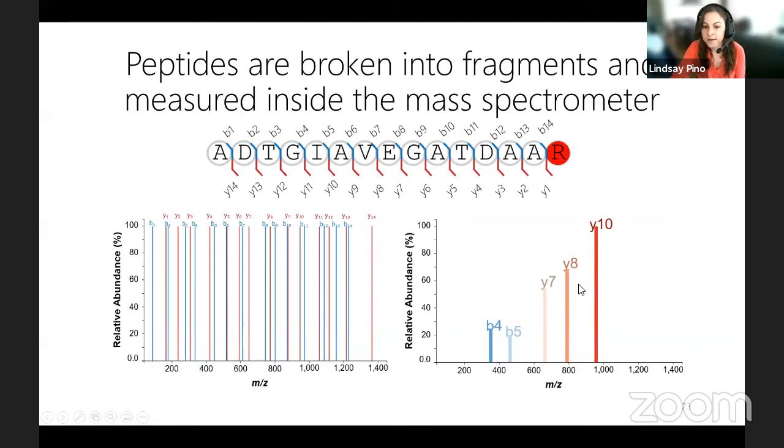Typically, when we see mass spectrometry fragmentation patterns, some fragments are much more likely and much more intense than others. Depending on how you set up your mass spectrometer, you can change the distribution of these fragments. But in a standard experiment, you would see some fragments more than other fragments, and that would show up as their relative abundance being more or less.